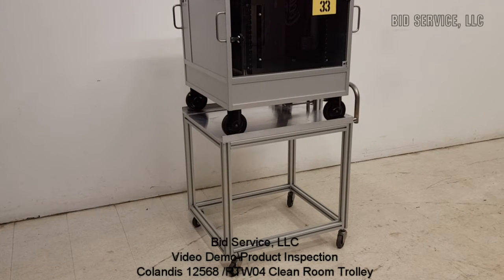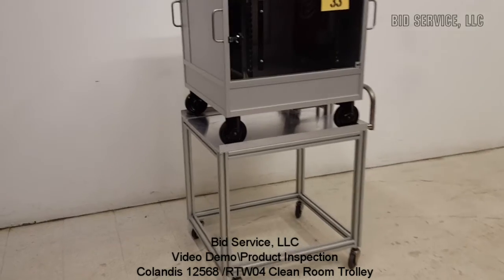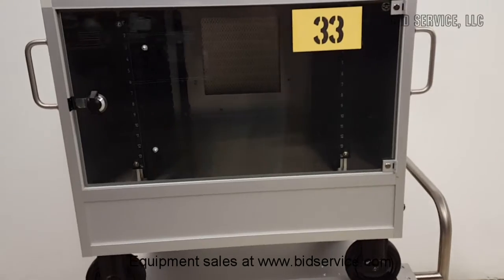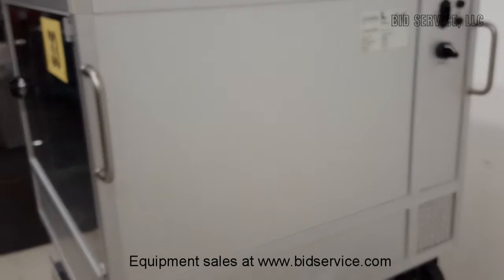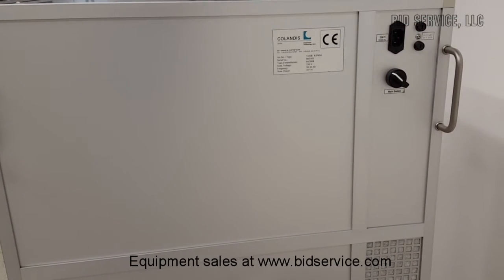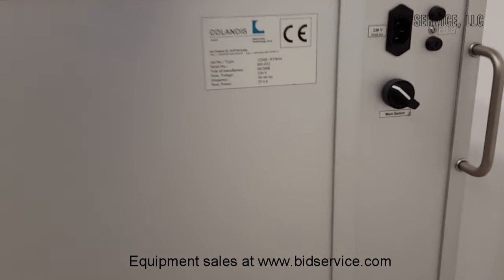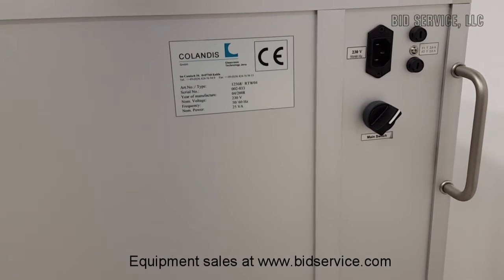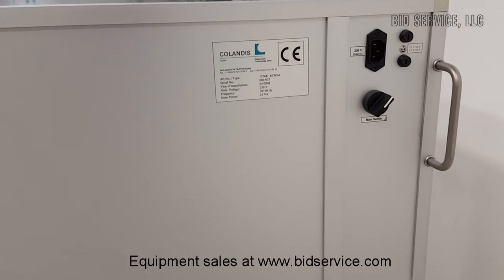This is the Calandas cleanroom trolley. It is powered at 230 volts. There's the main power switch. It also has a battery in it, so you can use it after it's unplugged.